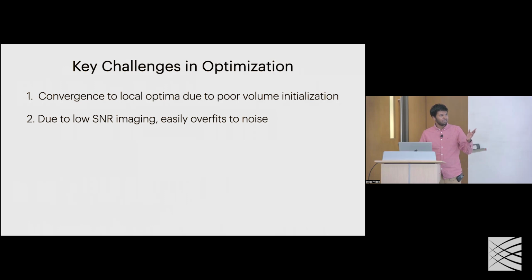Second, as we see, these images are extremely noisy. And so during this process of aligning images to the volume, it's very easy to overfit to the noise in the images rather than the underlying signal. And so we need some strategies for dealing with both these problems.